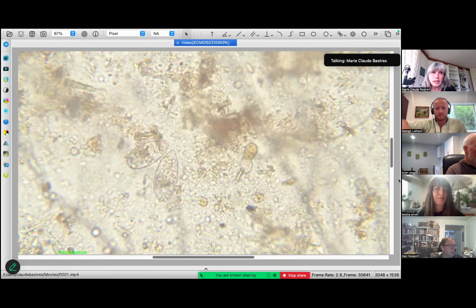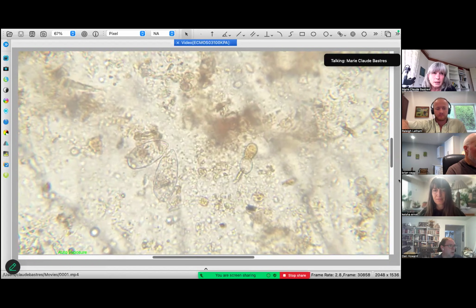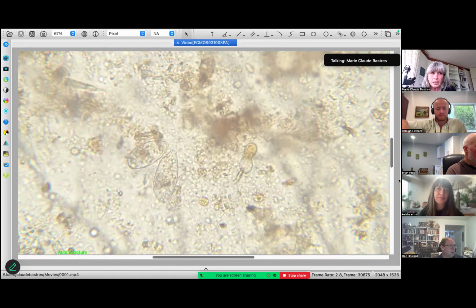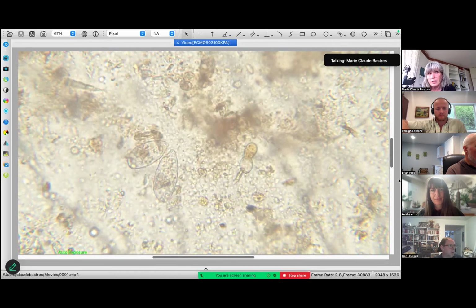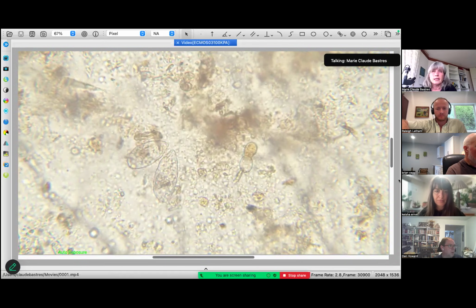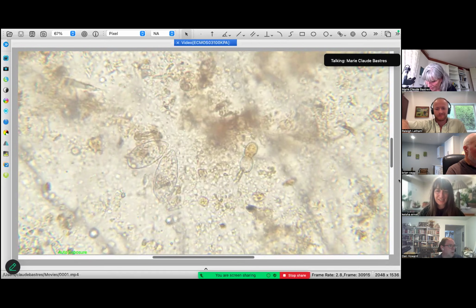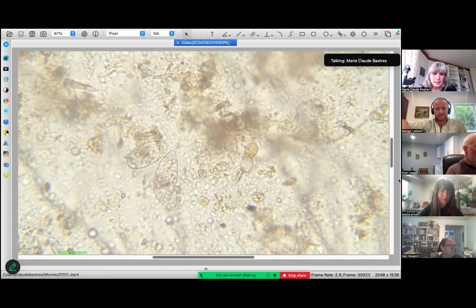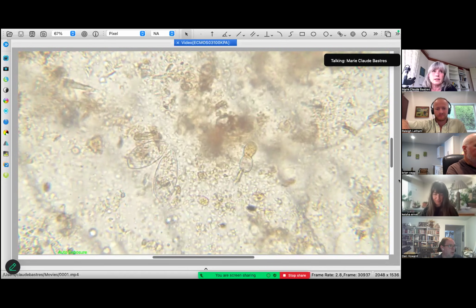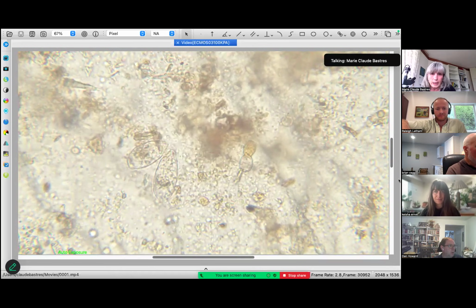It was sitting there about 6 months, in a bin, which is a wood bin, open. Here the wind is very big, so it's kind of dry on the top because of the wind. Sometimes we have up to 140 kilometers per hour. That's many miles, I don't know how many. It's very strong wind. And also it has been sitting outside under the rain. So the bottom is more wet and the upper part is dry because of the wind. So this is what we have in front, and it came quite well.